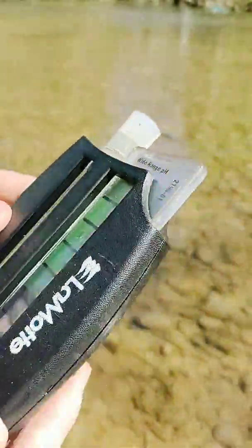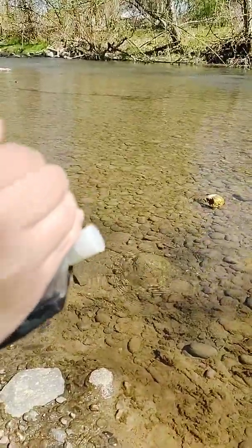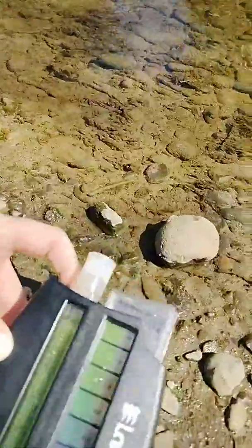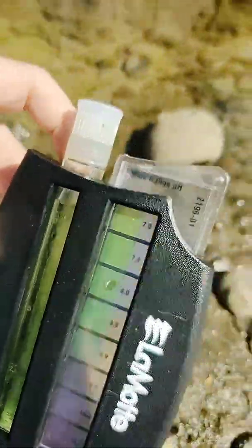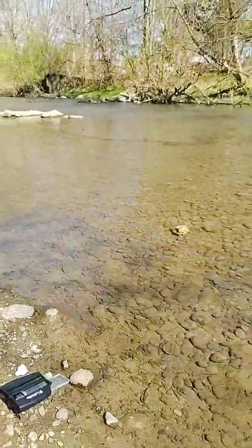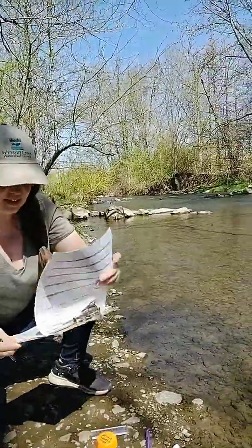Alright, now that we've done that, I'm going to take a look. It's a little green right now, so I would say our pH level is around the 7.5 mark. Go ahead and take a look again. Yeah, it might be a little hard to tell on video, but 7.5 is probably the range. So I'm going to write that down, and we're going to go over our measurements a little later.